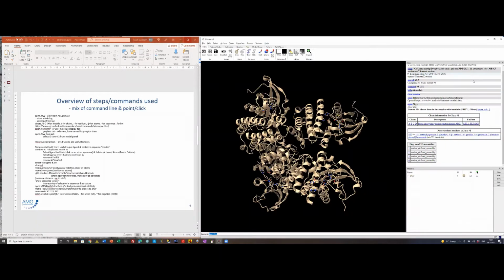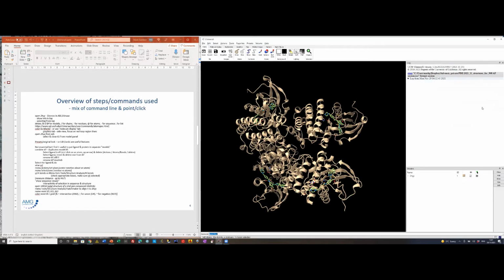And so you can do things like selecting the various chains directly from the log, which is nice, and also the ligand. It selects the 4 copies that are here in the crystal structure. You can also get more information. That's live as well.